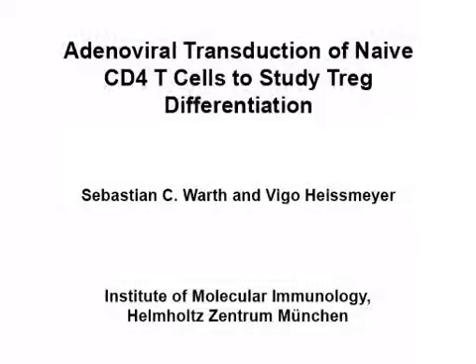This protocol provides a workflow for the production of infectious adenoviral particles that are used to transduce a gene of interest into naive T cells, which, upon ectopic expression of the transgene, are differentiated into regulatory T cells or Tregs.